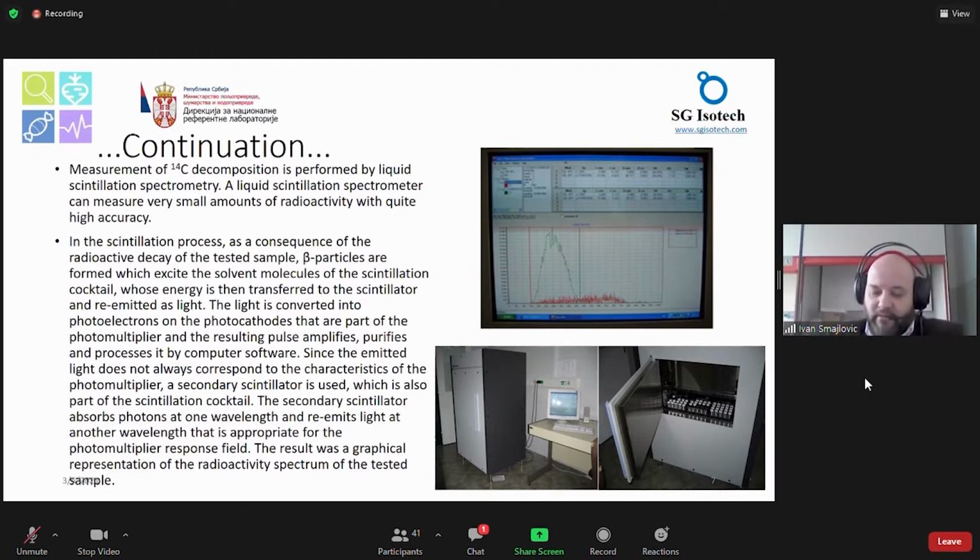So this line of the concentration of 14C in the atmosphere can be used for analyzing and saying if something is coming from a specific year. So is it 1968 or is it 1954 or something like that? So there are these data banks. They measured 14C in the atmosphere for years, and for each year they can say now from which year it comes. So this is another approach where you can say that something is coming from early history.